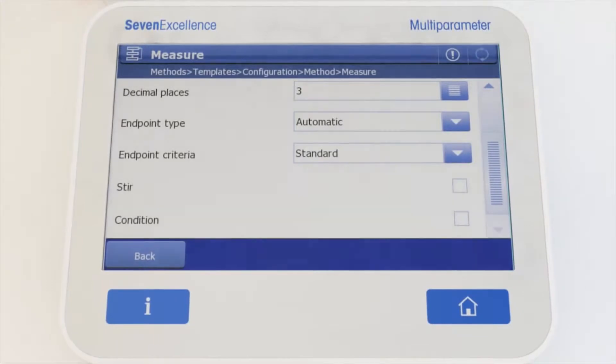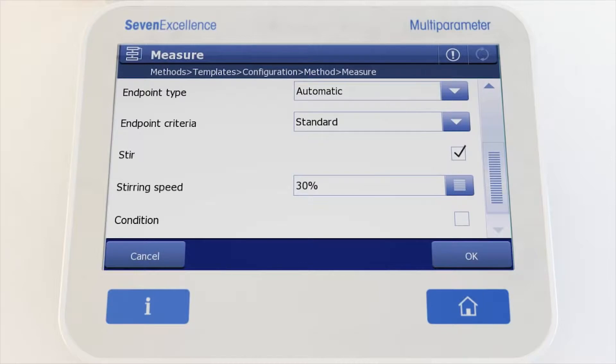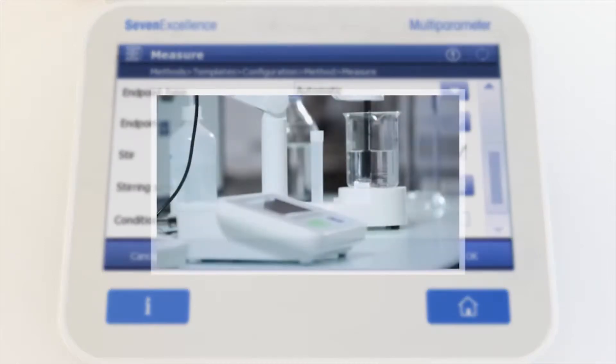The optional stirrer U-Mix provides additional precision. Stir your sample whenever needed, during or in between measurements, for highest repeatability.